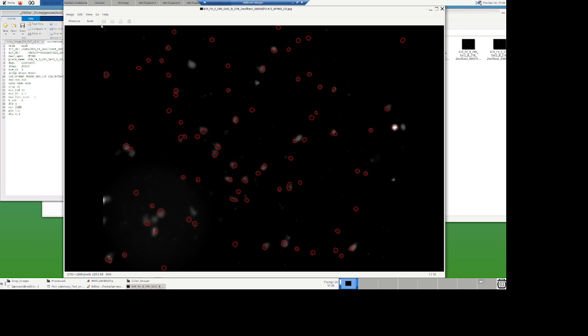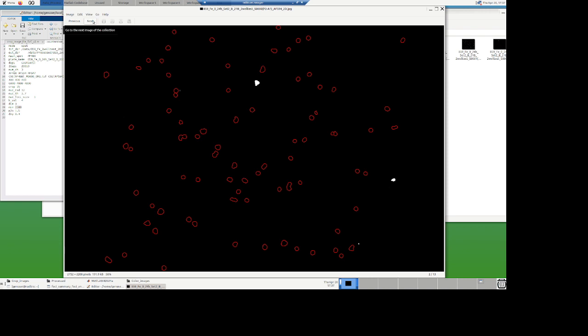So that's the channel for the foci. If I go next, that's the channel for 594, and you can see there's nothing there. Nothing is positive. That one is interesting. That one is positive. You can see how that cell is positive. That one is. This, I have no idea what that thing is. And there's some shift here which needs to be improved, but you can see how those stands really look.